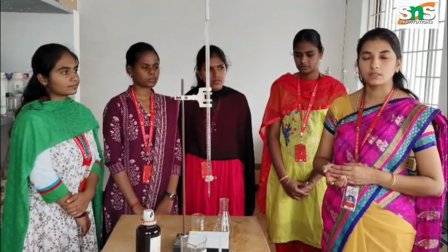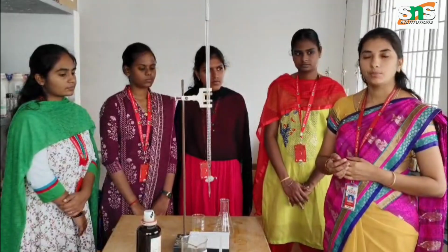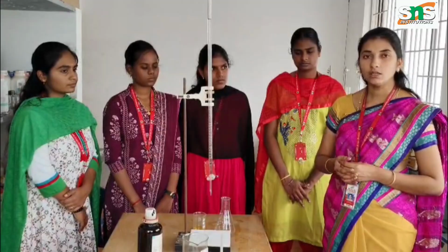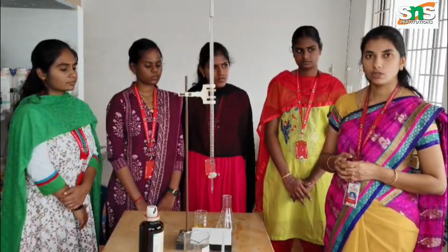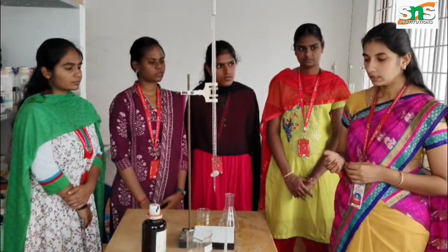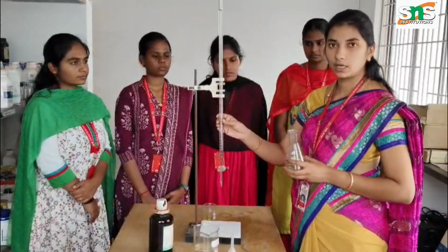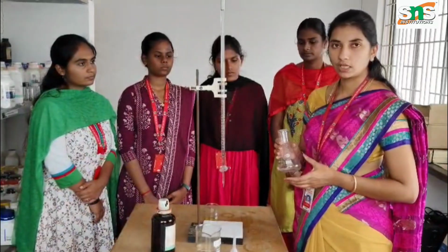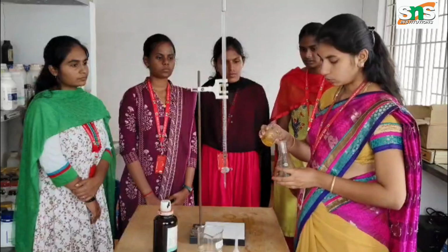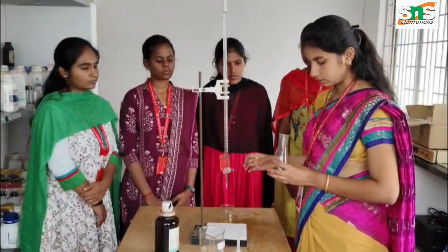a water sample. So here I am going to take the burette solution of silver nitrate and the pipette solution from this water sample, and as the additional solution we are going to take potassium chromate. Already we have taken the burette solution with silver nitrate, and with this pipette solution we have taken the water sample, and with this additional solution I am adding the potassium chromate into this conical flask, which turns into a clear yellow solution.